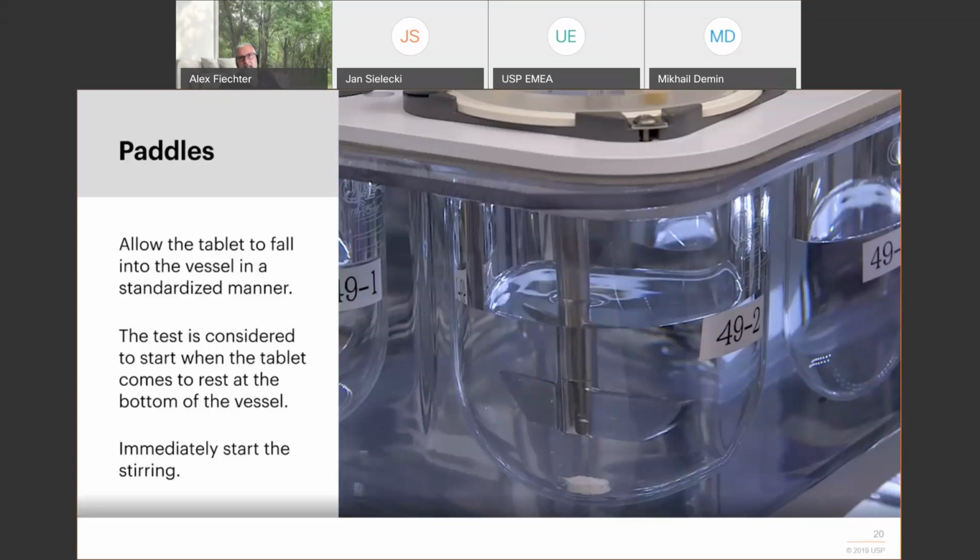So you have the medium, and again, it's also important what I said before, the medium degassing temperature that you have defined, and the transfer that gives you a final temperature at the vessel should ideally be met at 37 degrees centigrade so that you can immediately start. If you start to equilibrate the medium again because it has fallen below 37, or you need to wait for the temperature to come down, imagine what happens, especially for high head systems that may have covers or not. The exposure to environment, air conditions is huge, rearrangements can happen, and the success of having the media degassed is fading away.